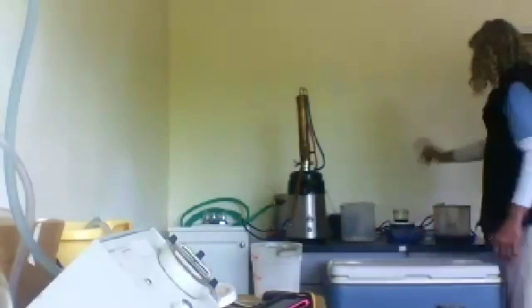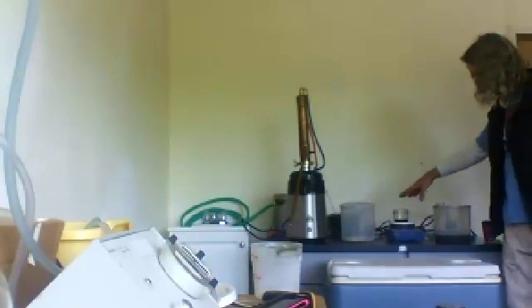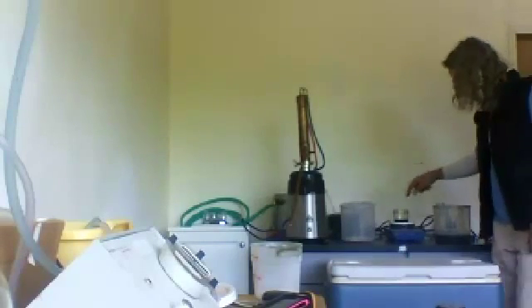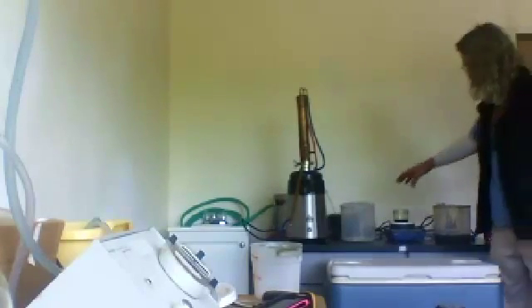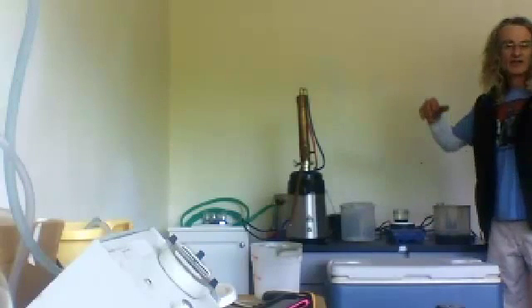Yeah, and these things are great. You can have these vessels, the beakers, as large as you want. The RPMs on this go up to 1500 RPM, and it can go up to about 460 Celsius. So this baby cooks, and you can actually heat up a water bath.